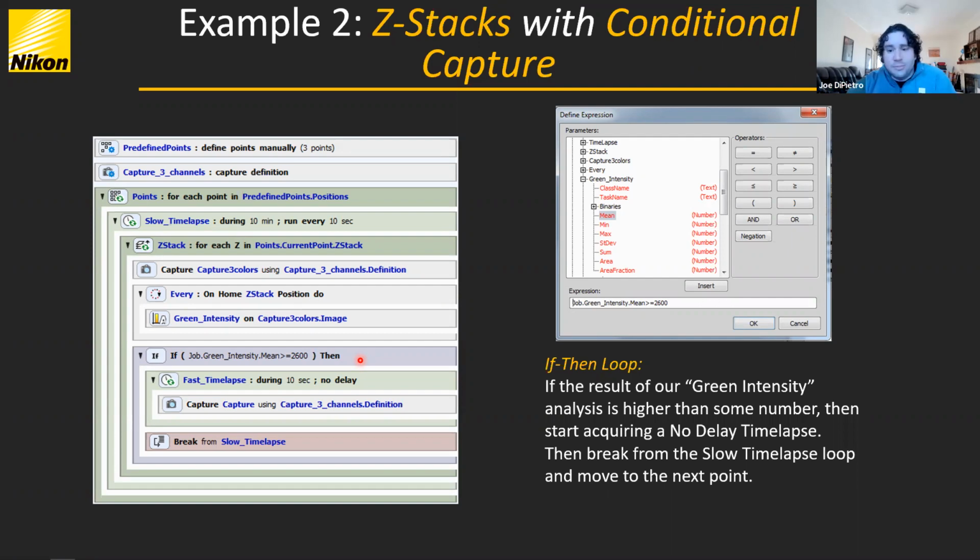do a time lapse. But a lot of times we end up going to random areas, getting a bunch of data that doesn't have anything interesting in it, or we spend all of our time trying to find the things that are interesting and don't actually get a lot of data. In this case, you can predetermine where a bunch of different points that you want, or tell it to find 100 or 1,000 random points or whatever, and do the analysis on the fly. If it meets the criteria, do the experiment, move on to the next one.